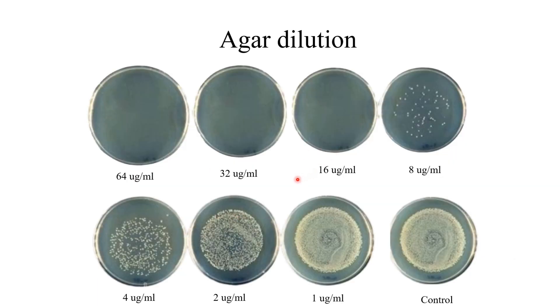After incubation we get results like this. You can see these three plates do not have any growth, and growth is starting from the fourth plate, which is 8 micrograms per milliliter. Growth continues to increase in subsequent plates, and the control plate also shows sufficient growth.